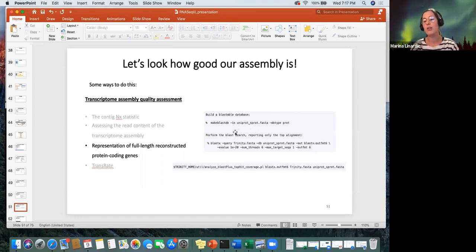You download it, you create a database using this command, makeblastdb. You just define which type it is, so it can be either protein or nucleotide. And then you perform the blast also locally on your computer. So you have BLASTX, BLASTN, tBLASTN, all of the ones that are available also on the BLAST website, of course.